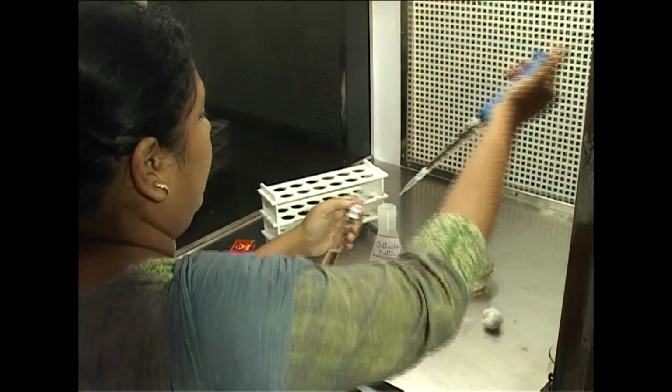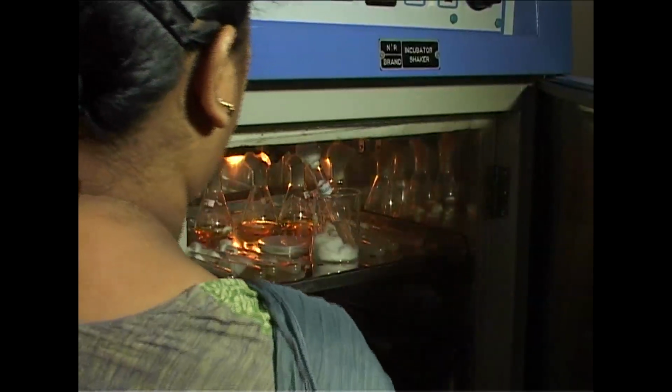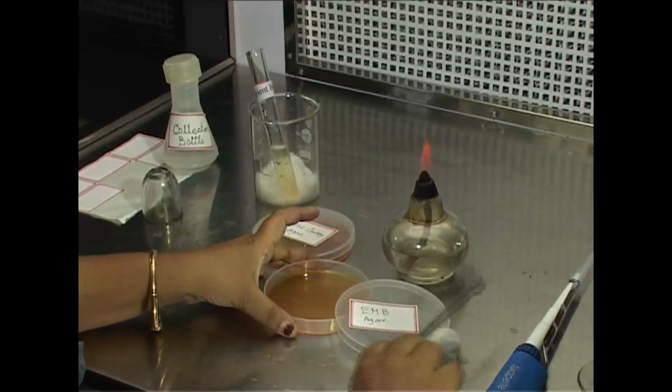First, the primary culture will be made by inoculation of the collected sample into the nutrient broth, and that will be kept at 37 degrees centigrade for 18 to 24 hours. After 24 hours, the growth will be streaked over the EMB agar as well as over the MacConkey agar.